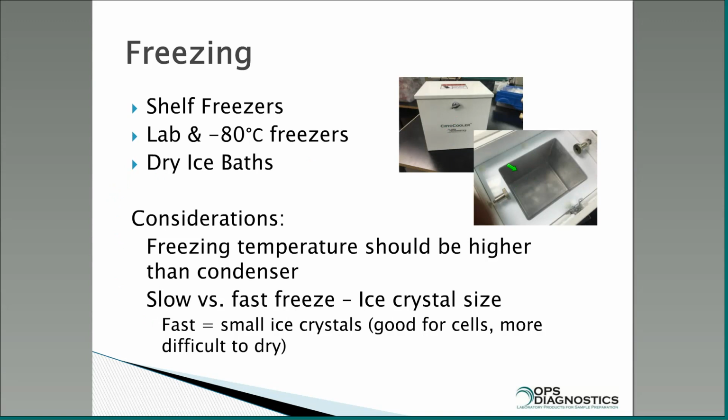And what I'm about to tell you, don't do, by the way. I have a little example of how things work. I wanted to freeze my sample, and in this case I was using both vials and ampoules. So I would put a glove on and insert them into the liquid nitrogen, and I can do one of two things. I can just put them down there and freeze them straight out, or I can put them down there and twirl them.